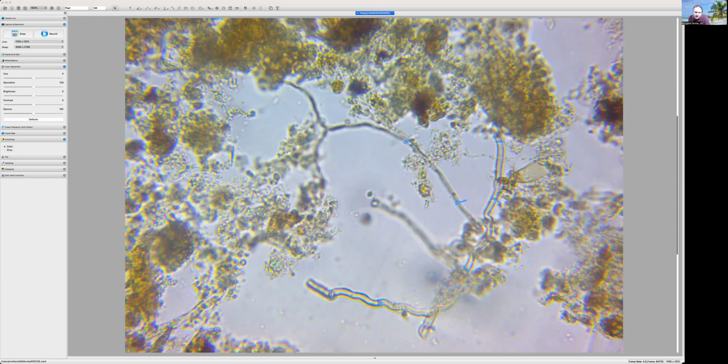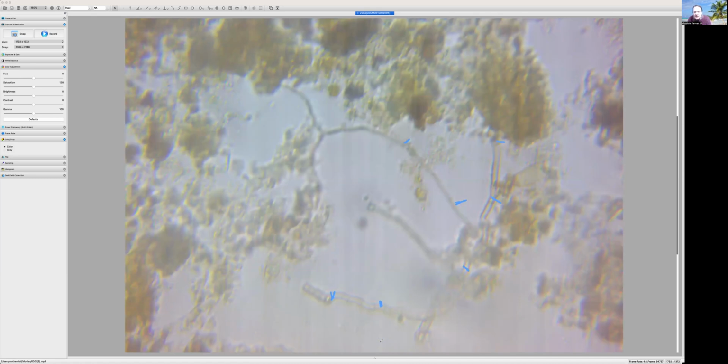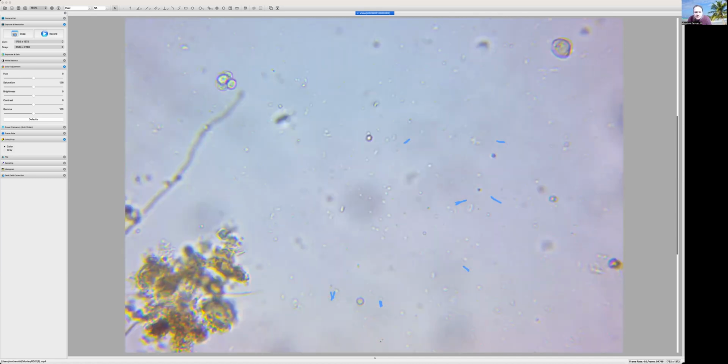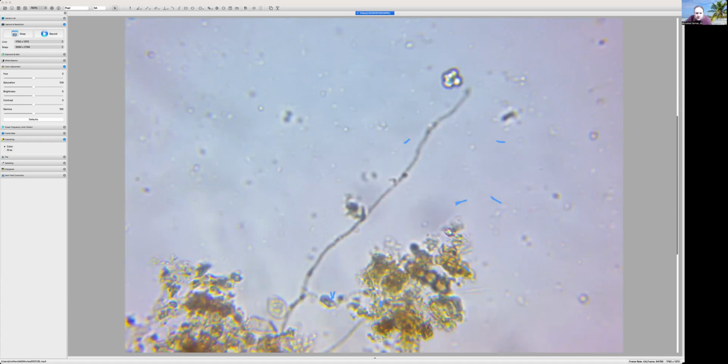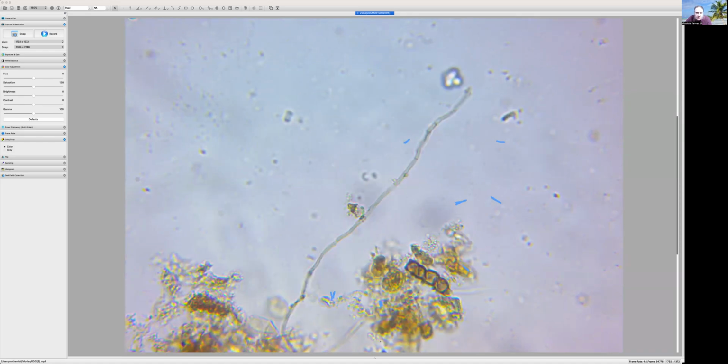And a possible septa there on that fungi. Two pieces there, different pieces. Here's one growing. Let's look and see if we can determine if it's yeah, it's got septa, real nice. For sure, beneficial fungi. It's got a different color, green. There's a septa.